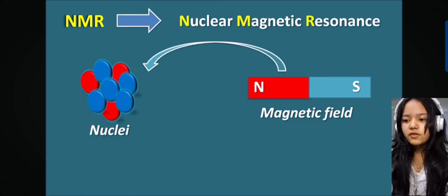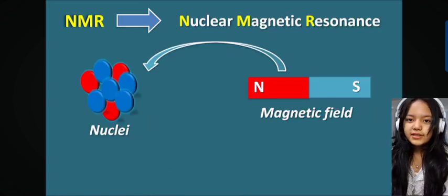In the presence of a magnetic field, the nuclei can exist in two states. One can be considered as the ground state and another as the excited state. And when we supply sufficient energy, the nuclei in the ground state jump into the excited state, resulting in the absorption in the spectroscopy. So let us see a simple example here.